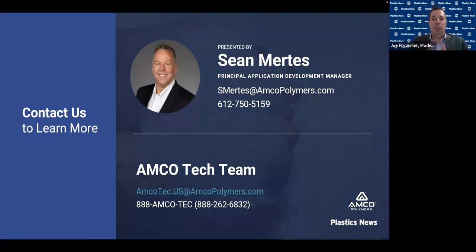Excellent. Well, a few other questions have come in here. How do I use a DMA curve to pick the demolding temperature? Is it just past the bend to the hotter side?